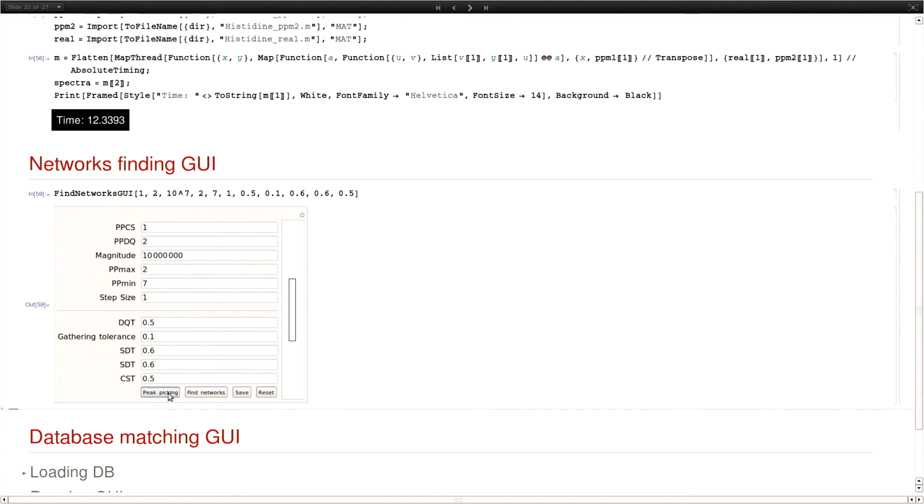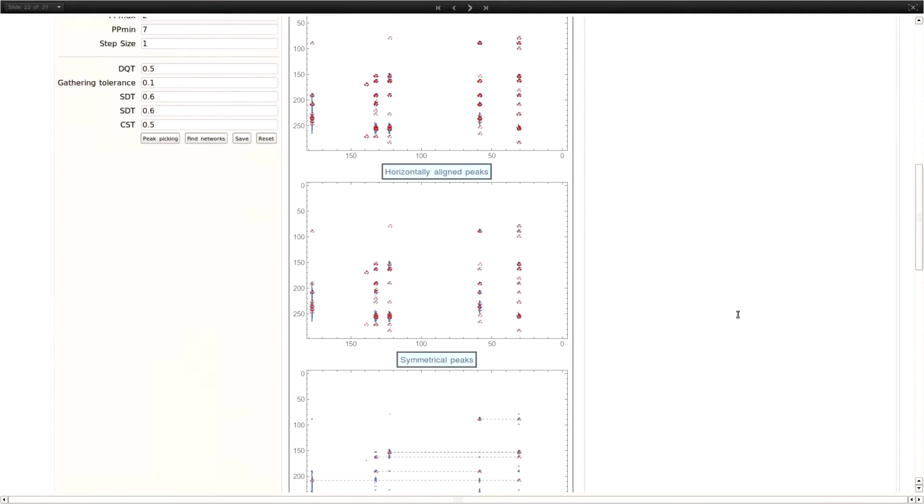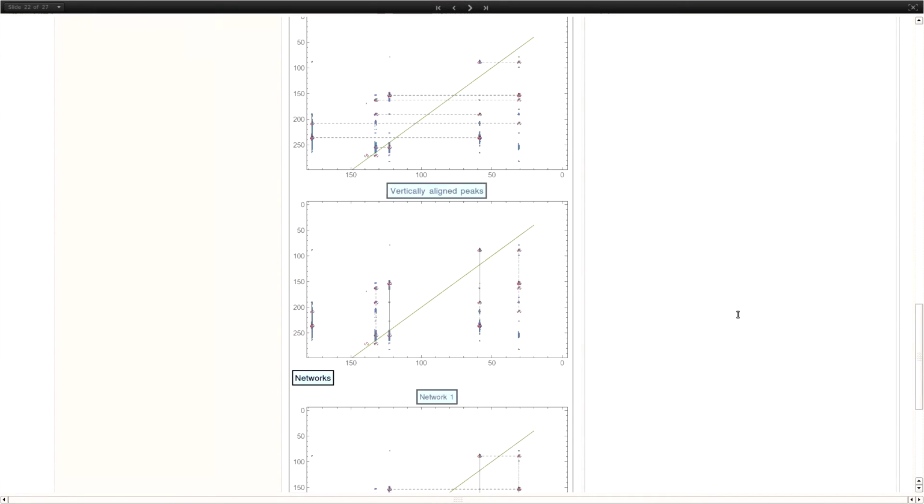All right, so the thing here, this GUI is just running all the steps I showed you, but in an automatic way. And the thing here is that we want to share this with the scientific community. So the scientific community wants buttons and text fields where they can insert data and press stuff and get information. So yes, with these buttons, I'm just running and getting all the things I just mentioned.